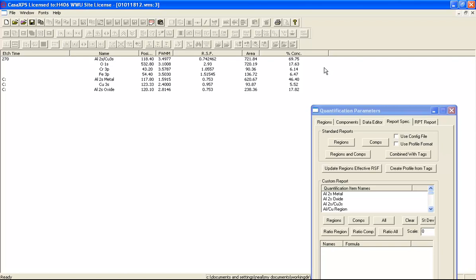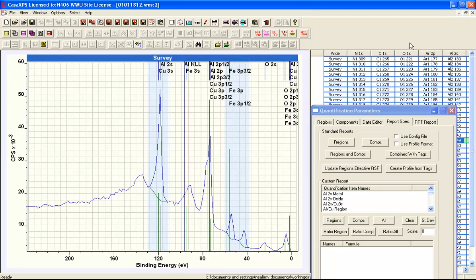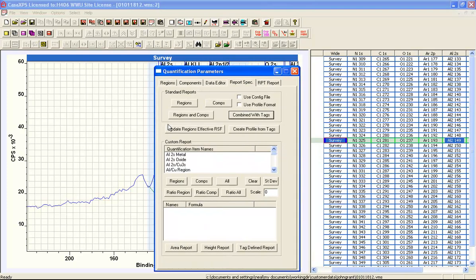We're now in a position to return to these data and consider how to quantify an entire depth profile using tags. This is the origin of the new button 'Update Regions Effective RSF.' The problem is that for each survey spectrum and each high-resolution spectrum, the proportion of copper, aluminium oxide, and metal changes, so the effective RSF changes as the profile progresses.